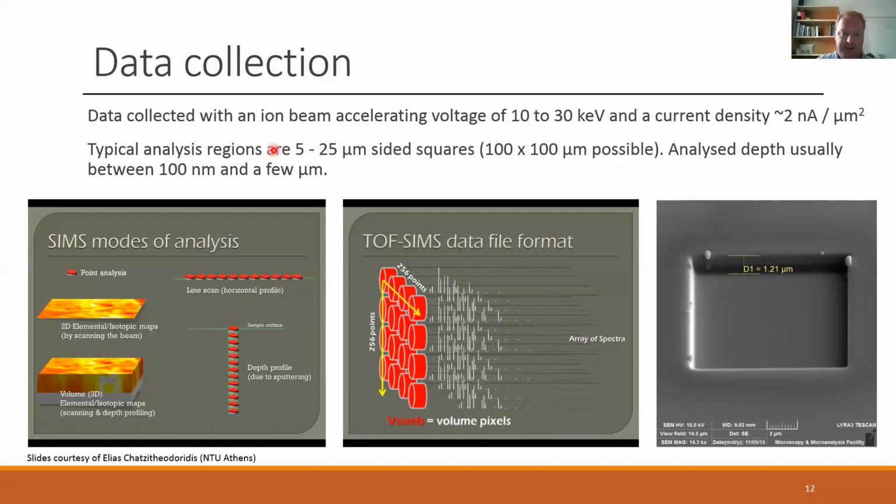Okay, I'll just go through a little bit of the principle of how it operates. We tilt the sample, so effectively, wherever the FIB scans, you can collect data. However, usually the way it's operated is we tilt the sample so the ion beam is normal to the surface, and we raster over a square area. And the longer you raster, the more data you collect.